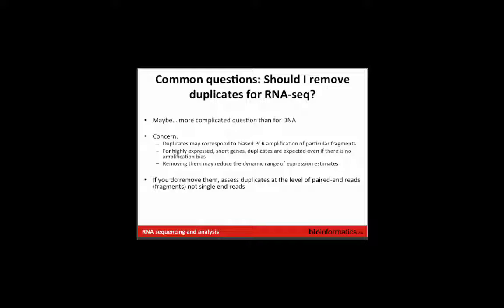So how do you deal with PCR overamplification? Yeah, so of course that raises the question. You don't. You hope that it isn't happening that much. You try to limit the amount of PCR amplification as much as possible.